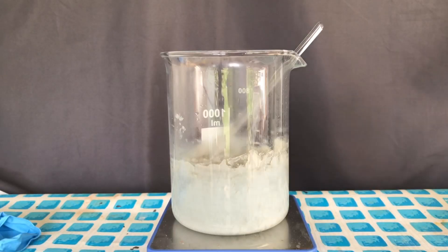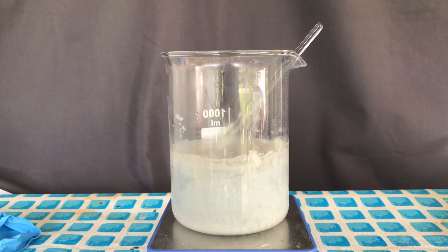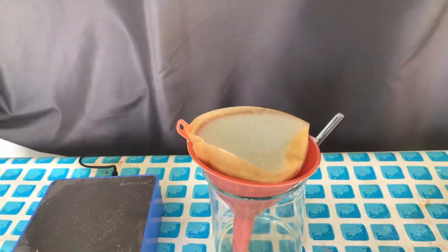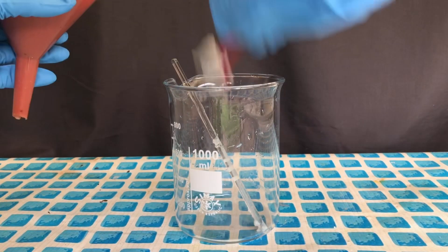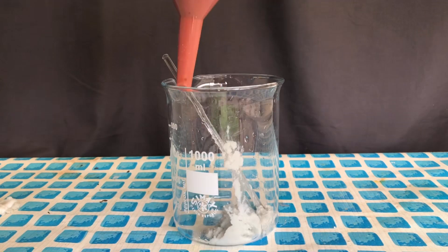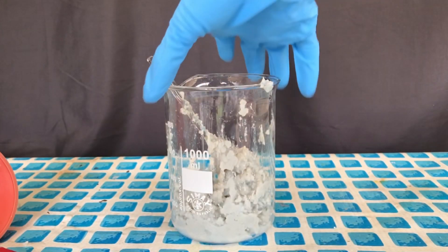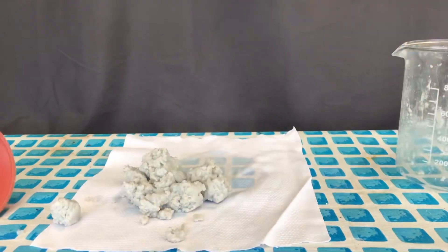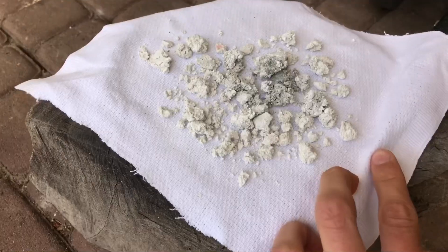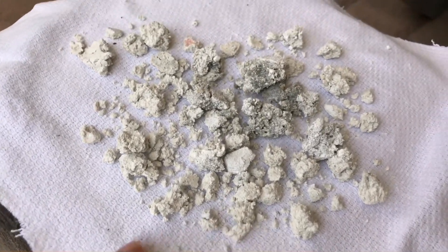Distilled water was added in an attempt to get rid of as much of the sodium hydroxide as possible. Gravity filtration was performed in order to dry it, and the gel was transferred to a large beaker. I wanted to dry it in the microwave at first, but after microwaving it for 10 minutes it still wasn't dry enough. For this reason, we dumped it onto a towel and let it air dry.